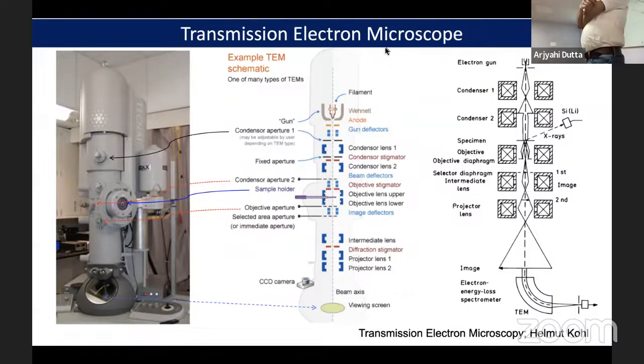One is the wavelength of that light, right? That is what we are talking about. There is a limiting factor: if you remember Rayleigh's equation, how we can calculate the resolution. Consider that one car is coming on a highway and we are far away, so you cannot differentiate the two headlights, right? After a certain distance, when you are very close, you can see that the two headlights are separated. So Rayleigh's equation is talking about the same thing. When there are two points, the minimum distance where they can be isolated from each other, not merging together, that distance is called the resolution.